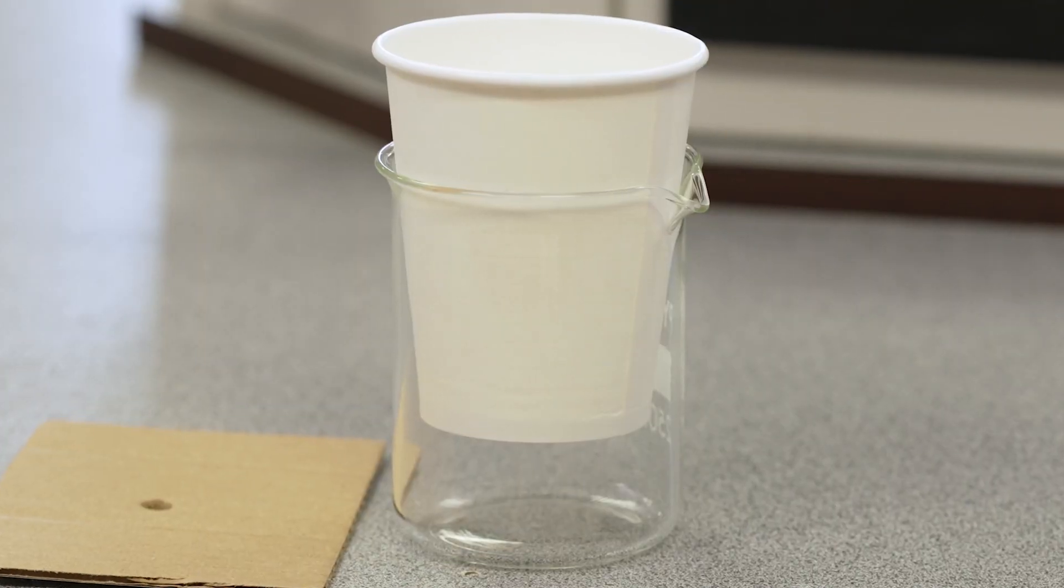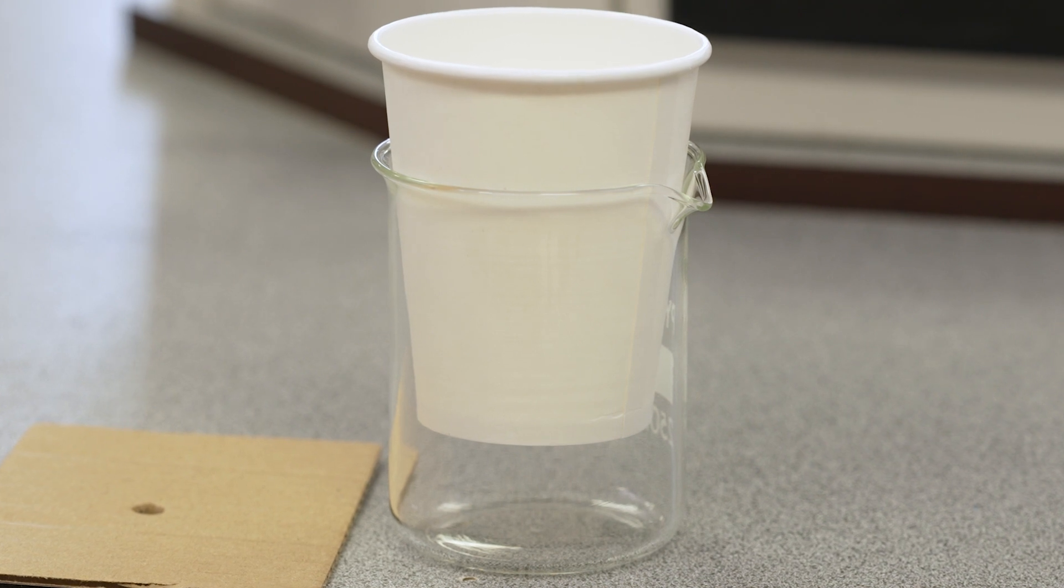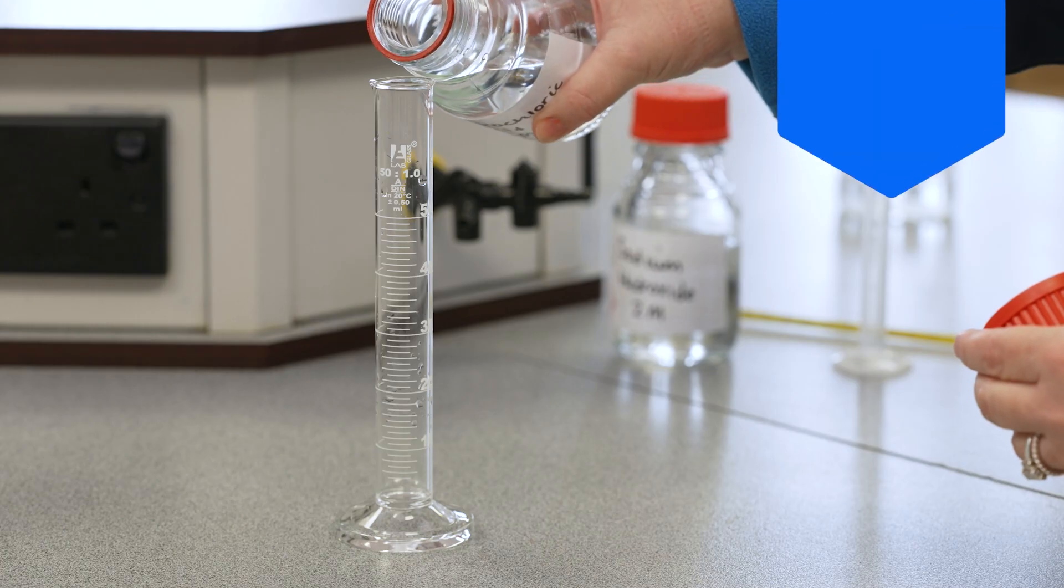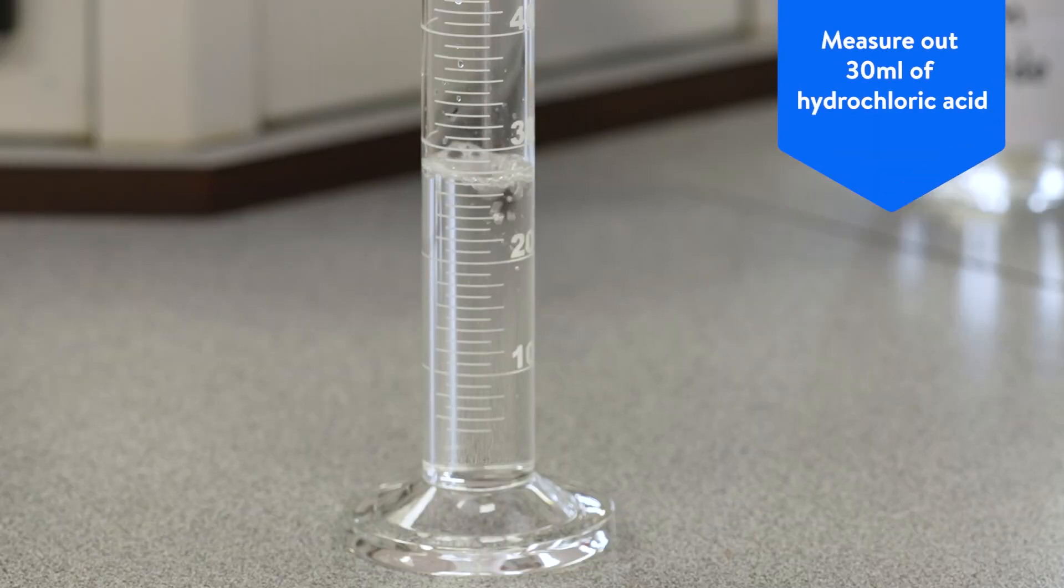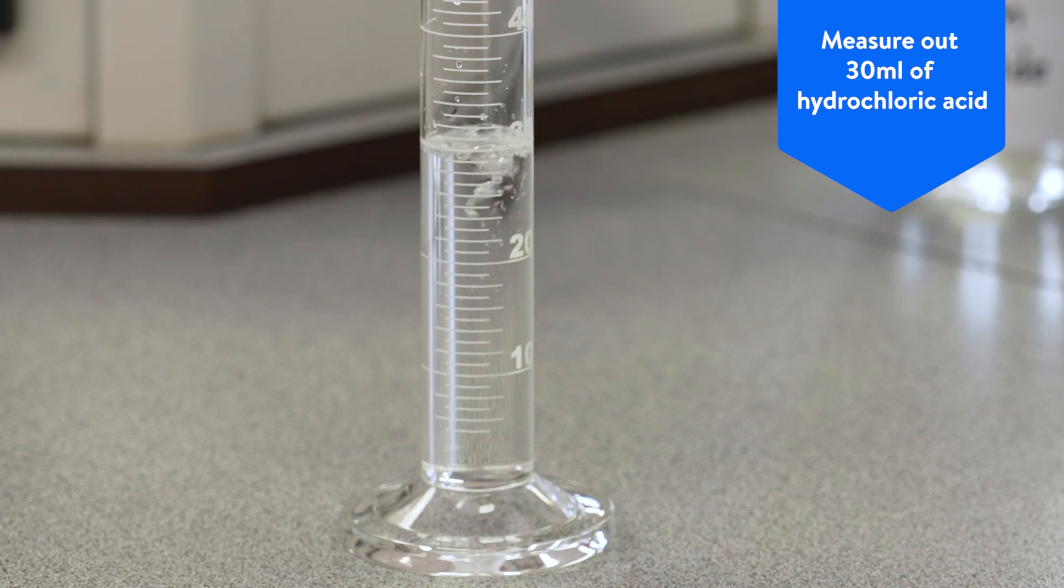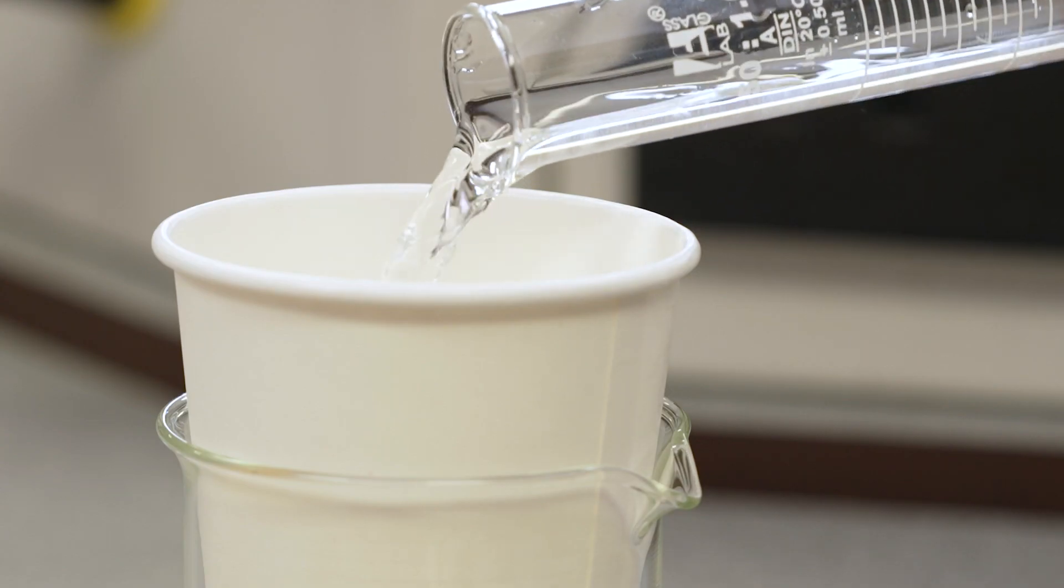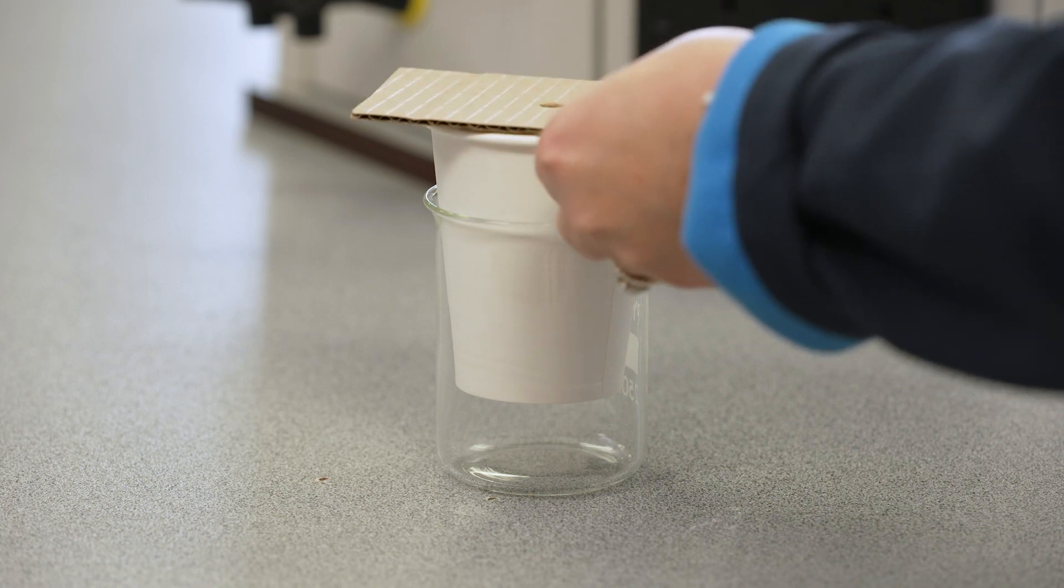Stand the insulated cup in the 250 milliliter beaker. Carefully measure 30 milliliters of hydrochloric acid into the measuring cylinder then pour into the insulated cup.